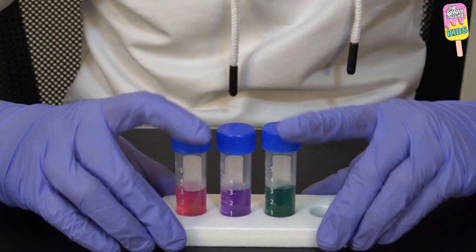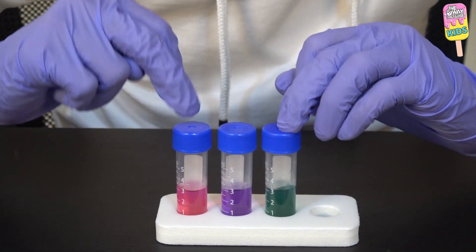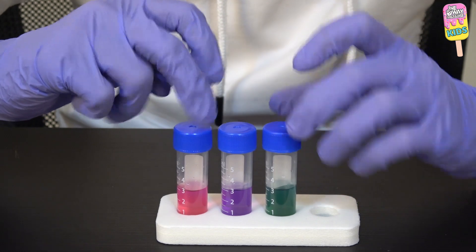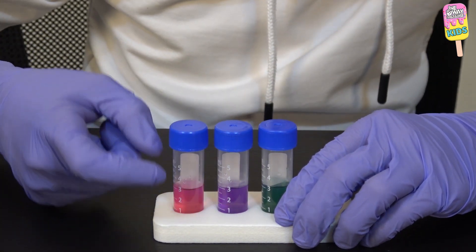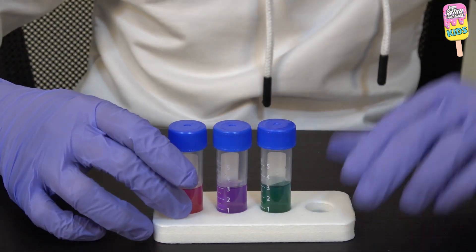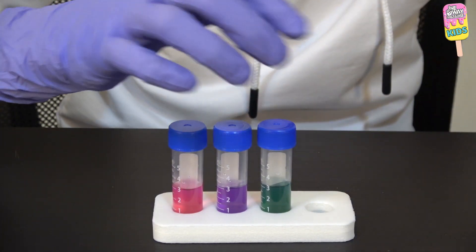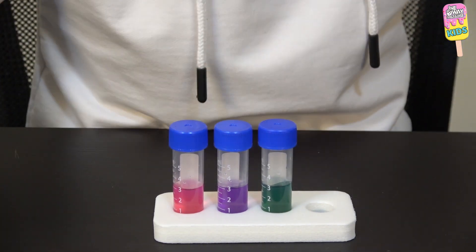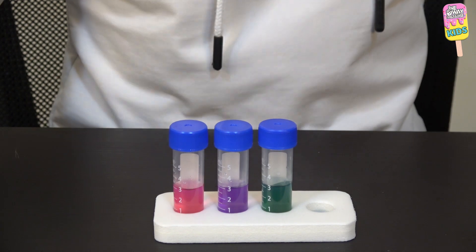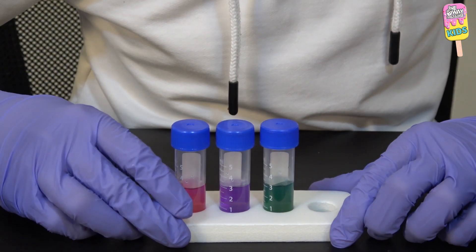The liquid in these two vials have changed color. This purple one was our original, and we put sodium carbonate into this one and it turned green, and citric acid into this one and it turned pink. Now I'm going to prepare the pH indicator strip.